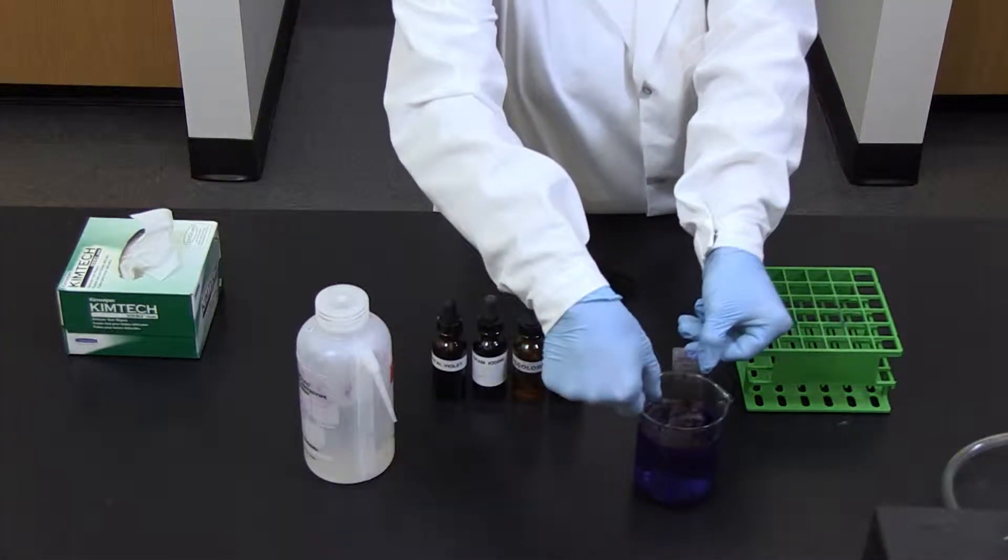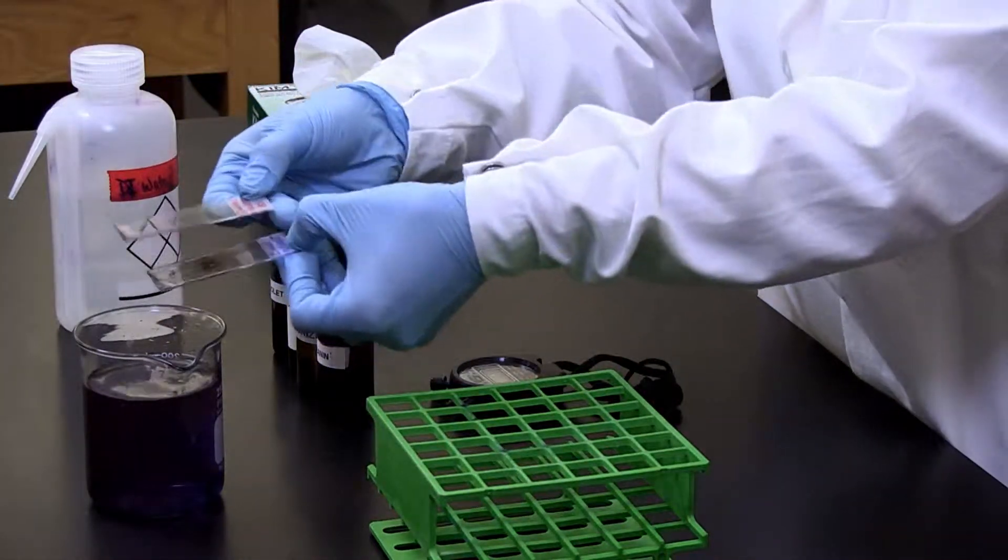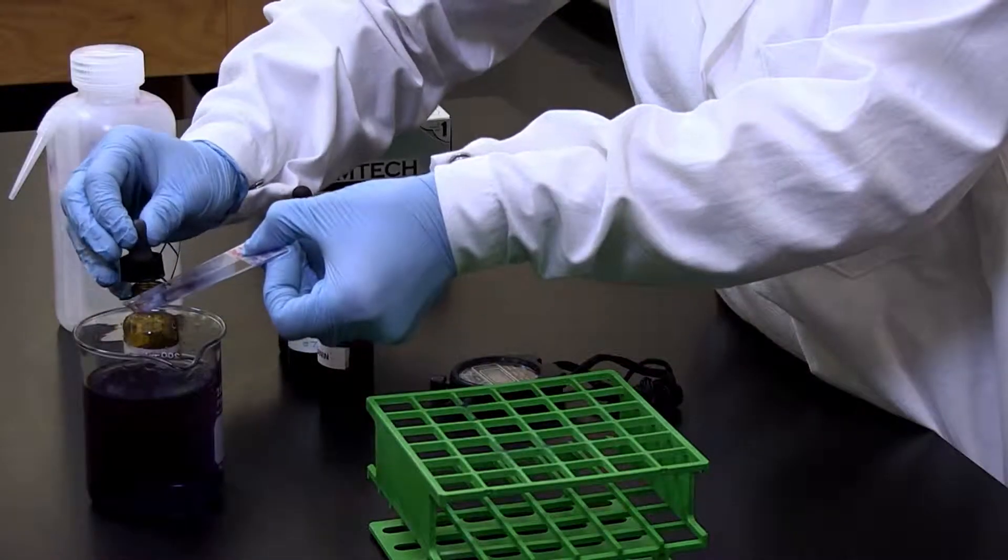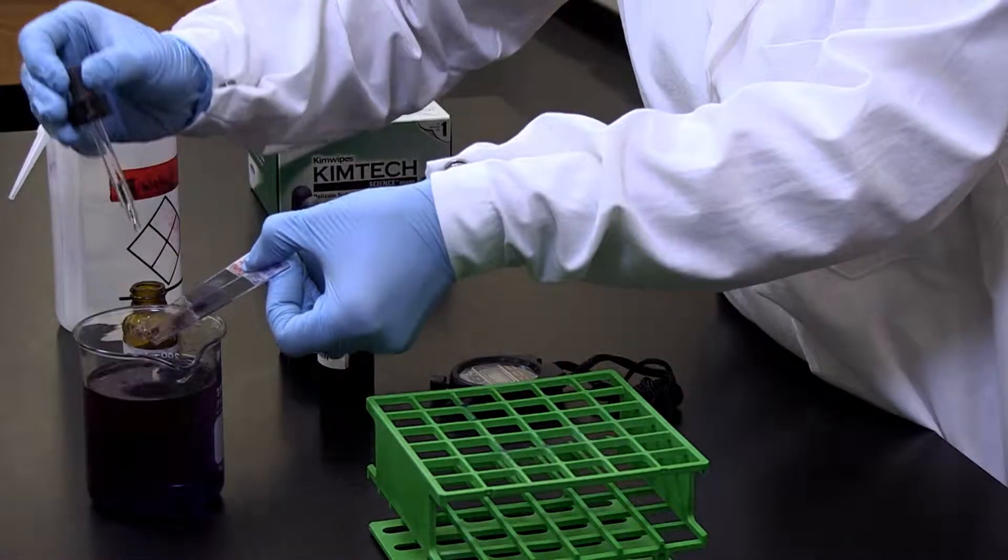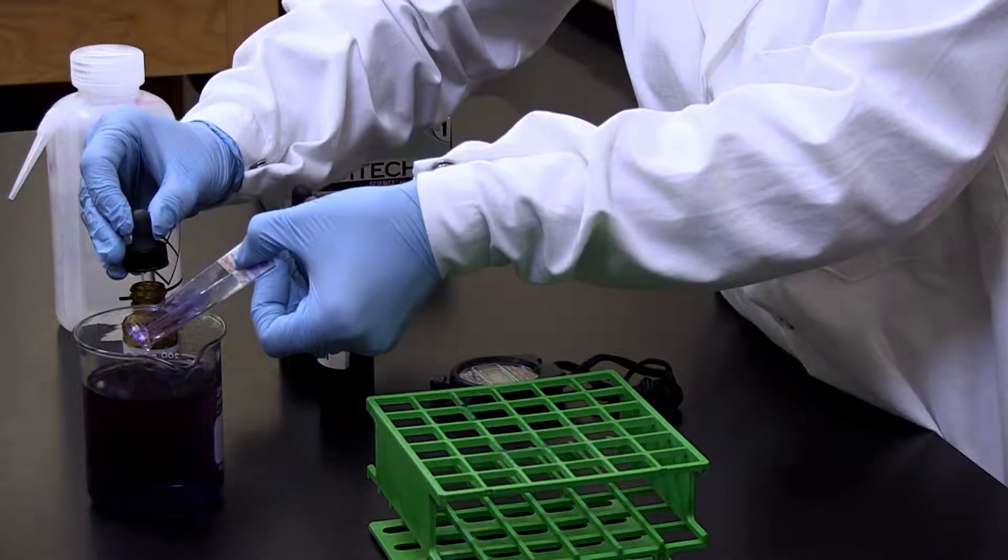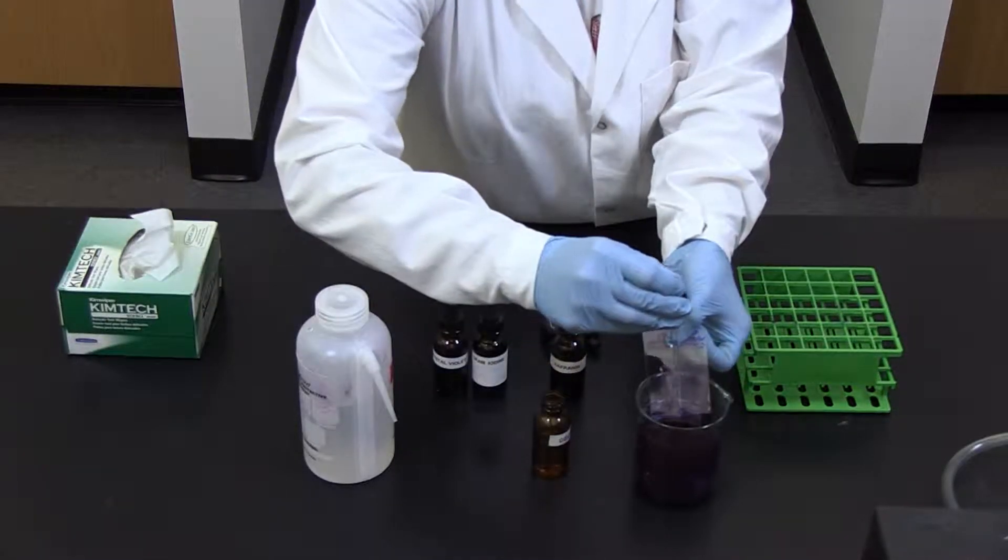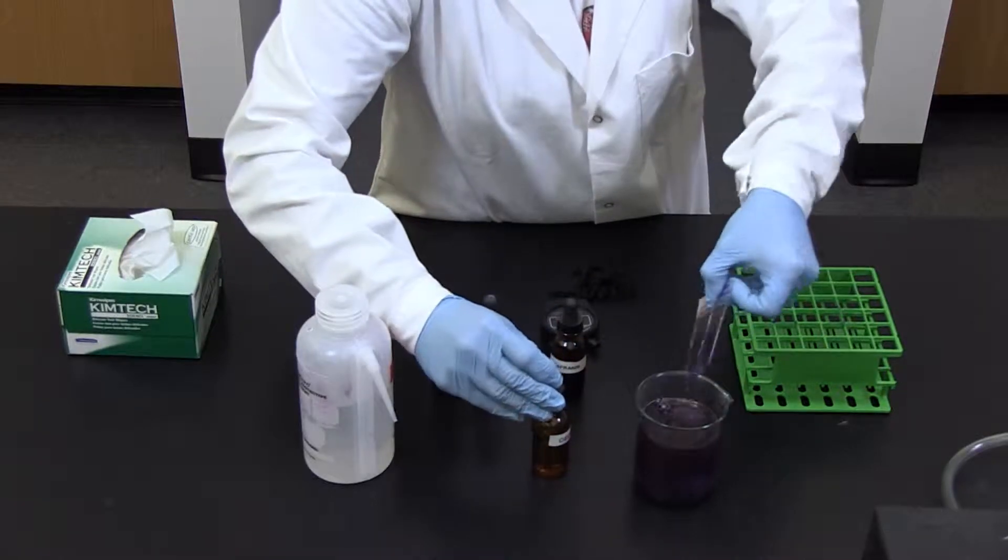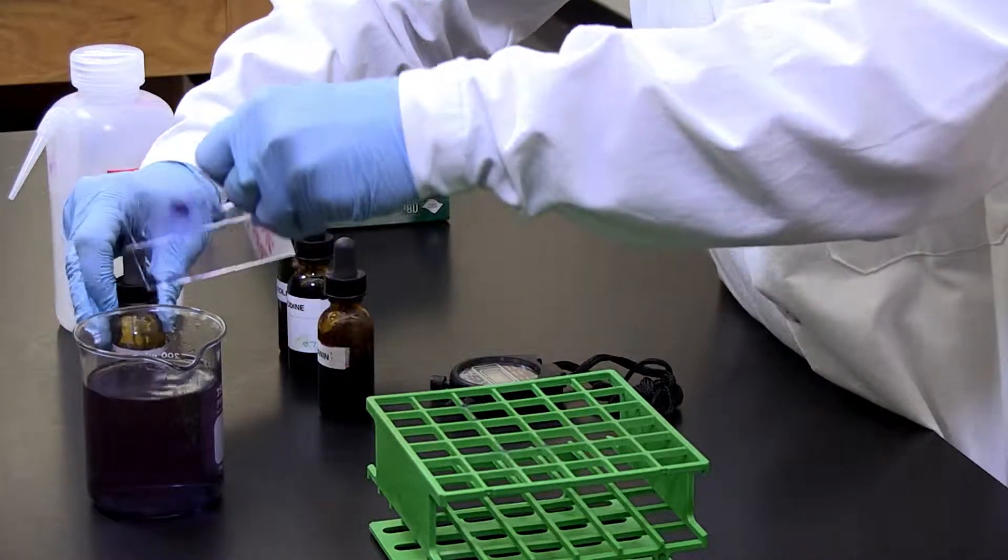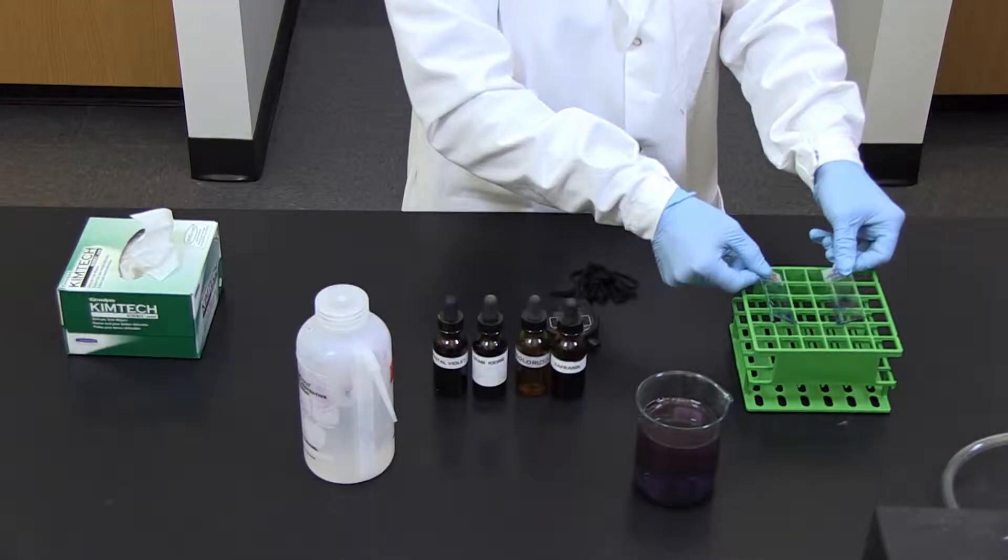Five, decolorize the smears with decolorizer, a mix of 95% ethanol and 5% acetone, for no more than 20 seconds. Allow the alcohol to flow over the slides until the runoff is colorless. The alcohol dissolves the lipids that are found in the outer membranes of gram-negative cells, allowing the crystal violet-iodine complex to escape. At this point, gram-negative cells are colorless, while gram-positive cells are still dark purple, if viewed under a light microscope.